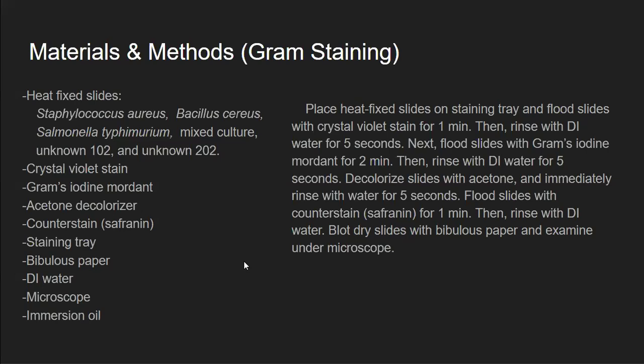Then rinse with deionized water for 5 seconds. Decolorize slides with acetone and immediately rinse with water for 5 seconds. Flood slides with counterstain, safranin for 1 minute. Then rinse with deionized water. Blot dry slides with bibulous paper and examine under microscope.